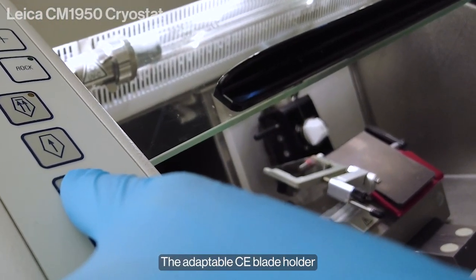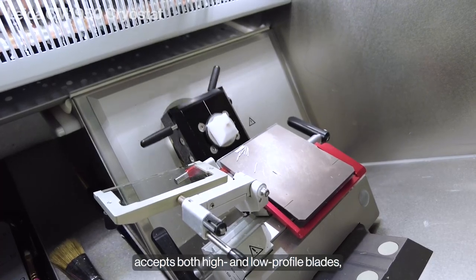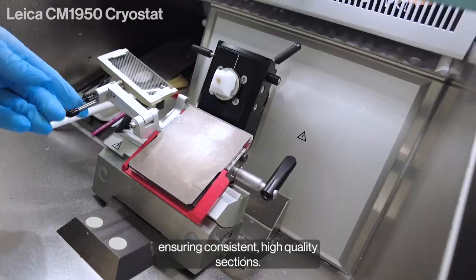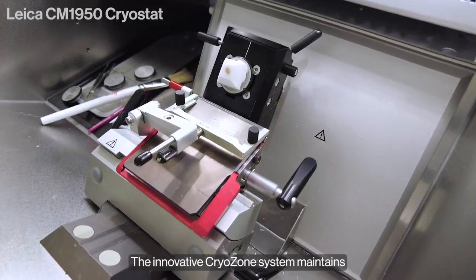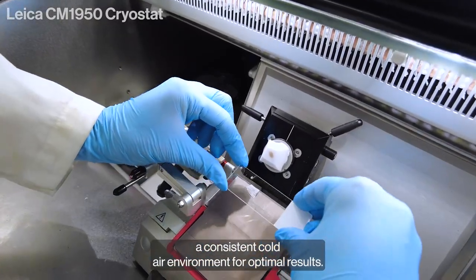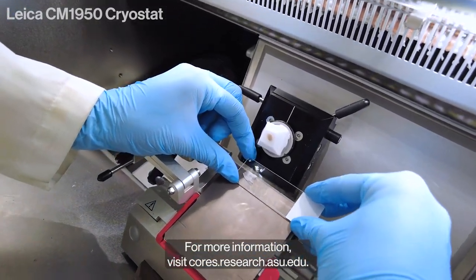The adaptable CE blade holder accepts both high- and low-profile blades, ensuring consistent, high-quality sections. The innovative Cryozone system maintains a consistent cold air environment for optimal results.